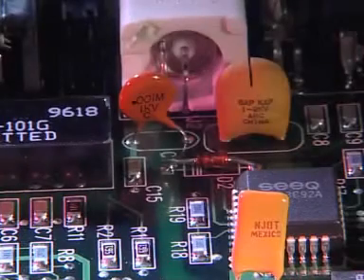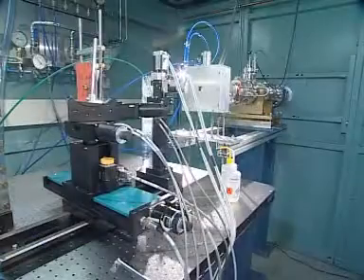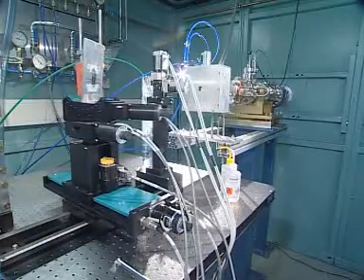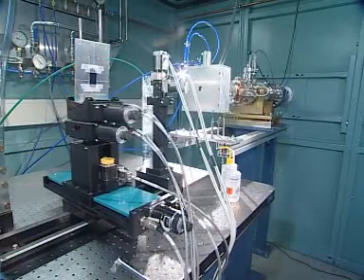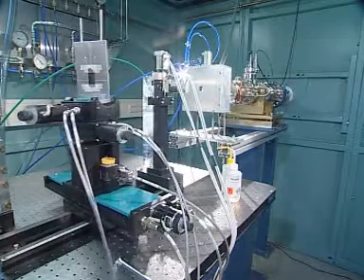In many applications, such as in computer chips or semiconductor lasers, the crystals used must have no or only very few dislocations. A fast, non-destructive method of examination is needed to verify this condition: X-ray topography.